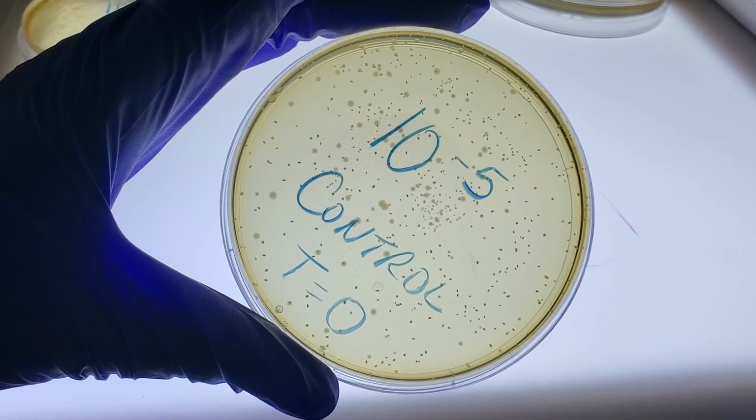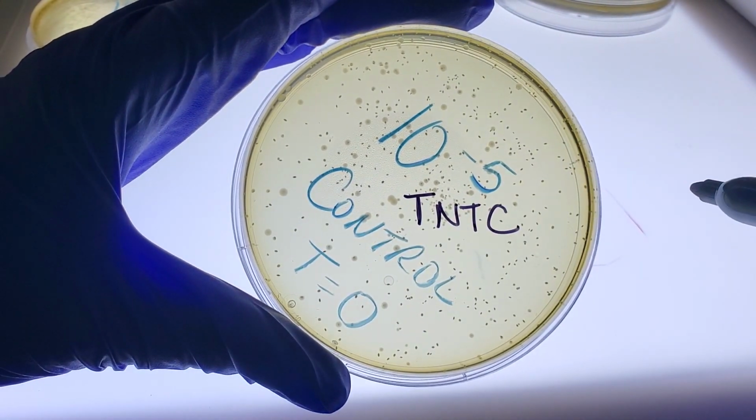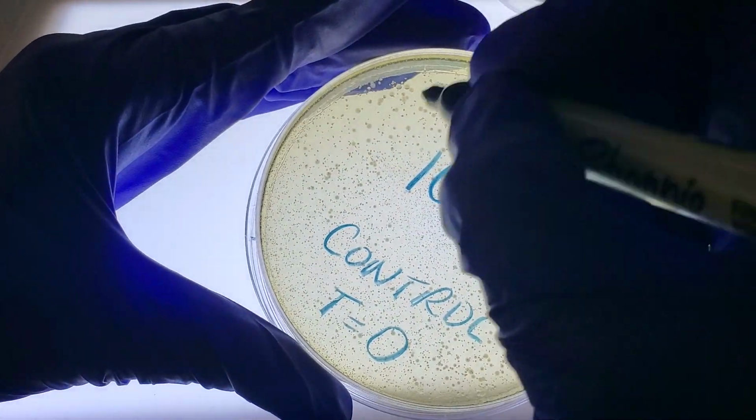If there are too many colonies, then I'll write TNTC, which stands for too numerous to count. Good luck.